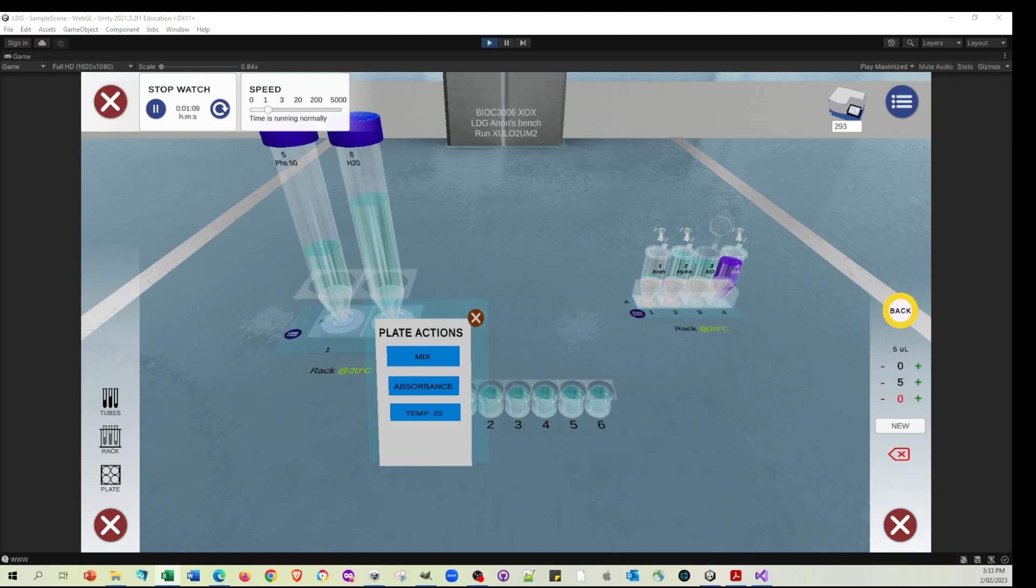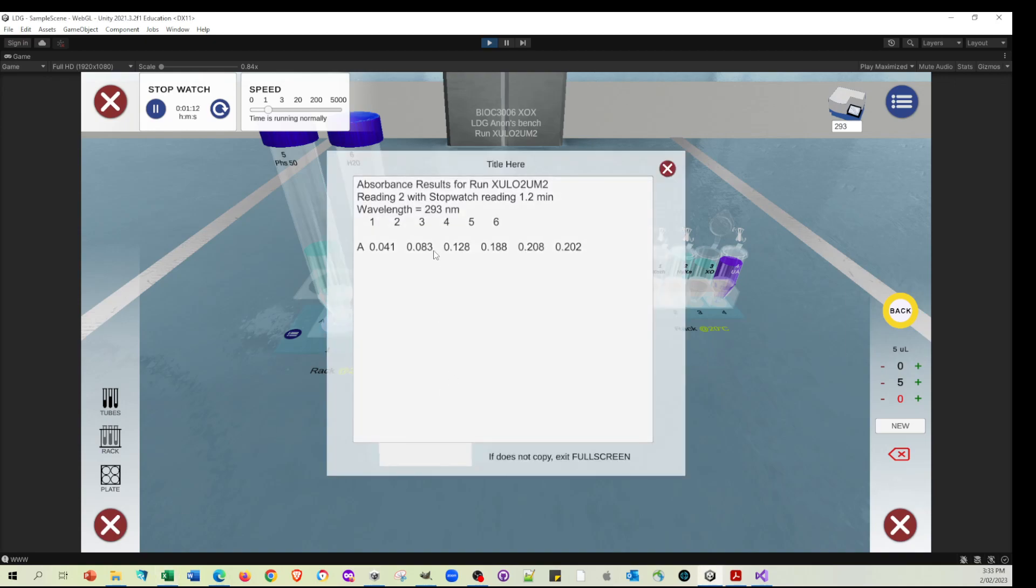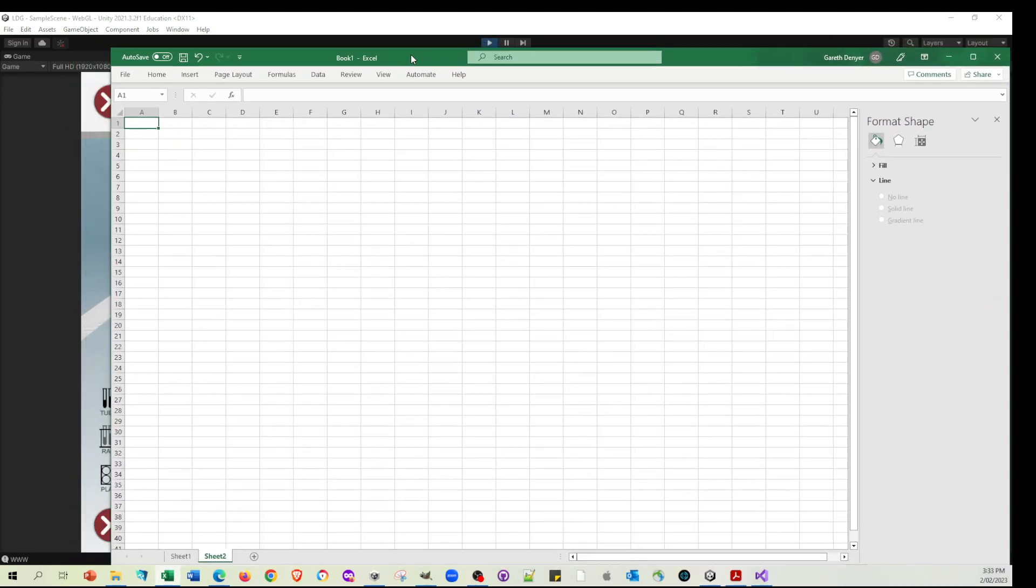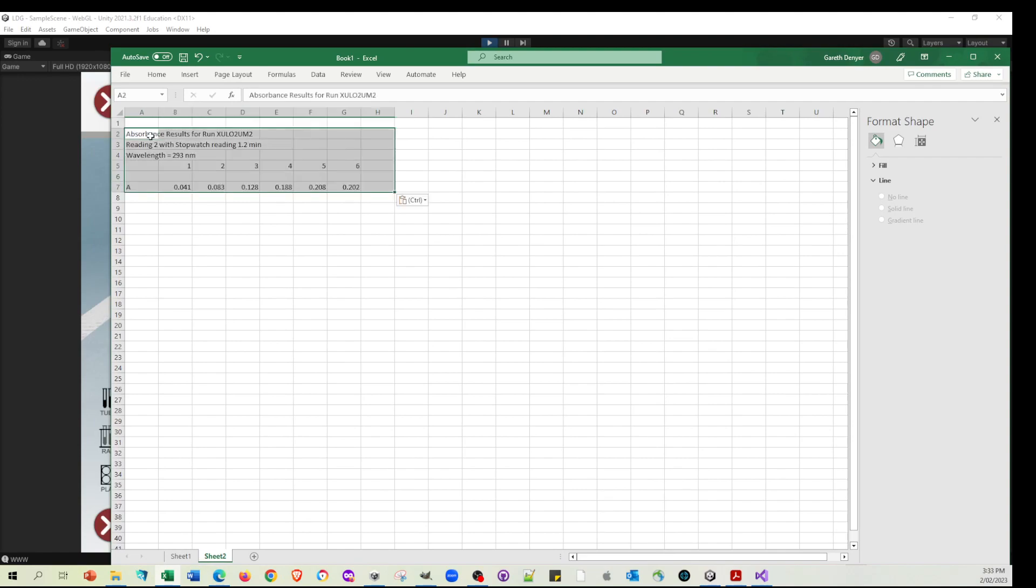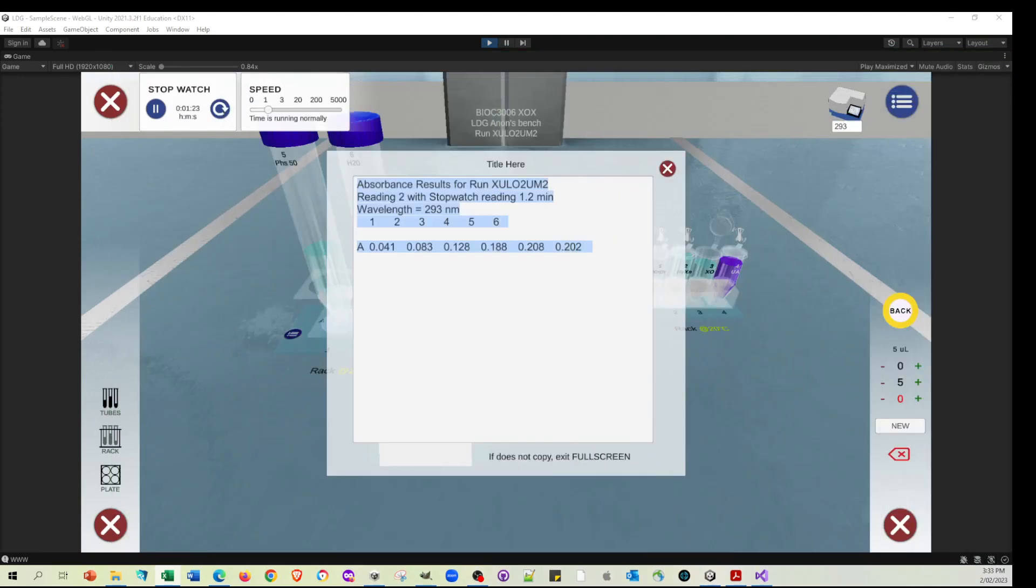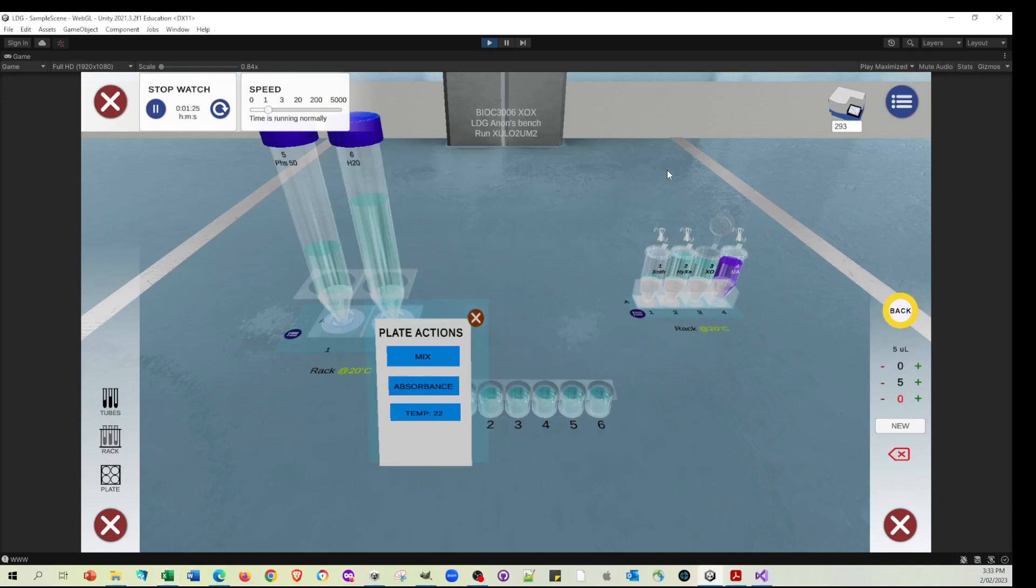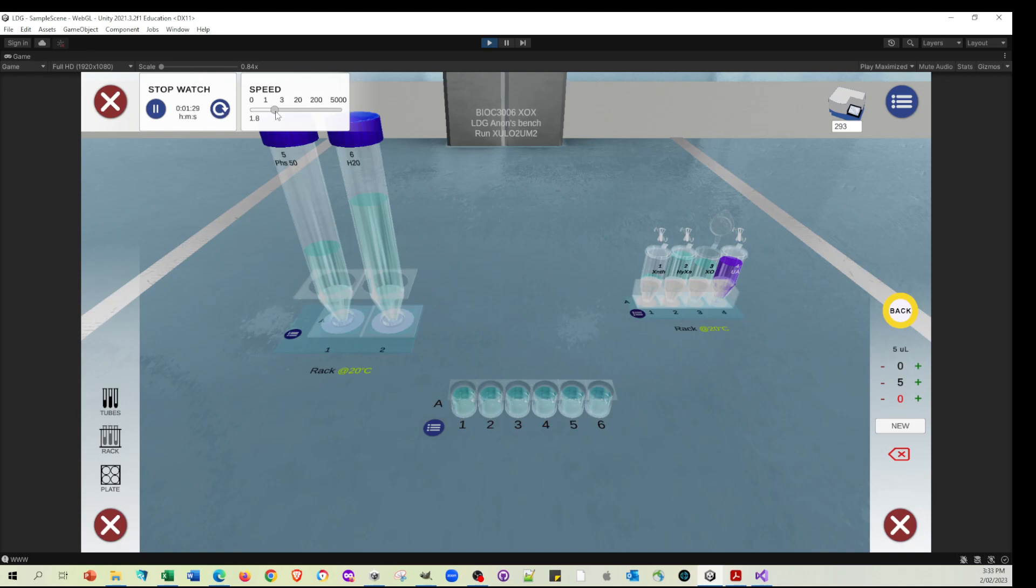I'll make an Excel spreadsheet. And we can continually monitor this. If I go to absorbance, copy all of this, and then bring the Excel in and paste it. So after 1.2 minutes, we've got these values. Let's just crank the speed of time up a little bit so that we can just not have to hang around for our next reading for too long.